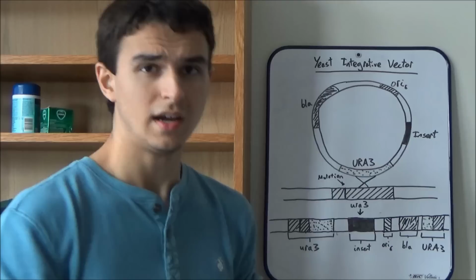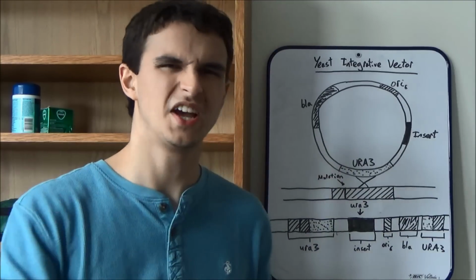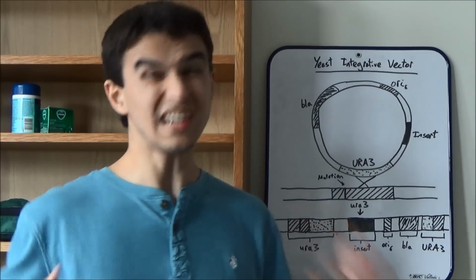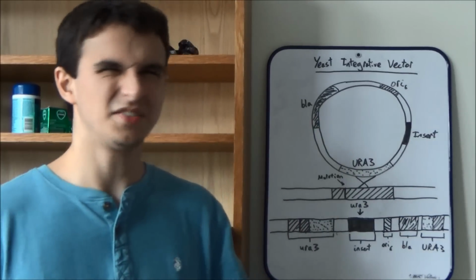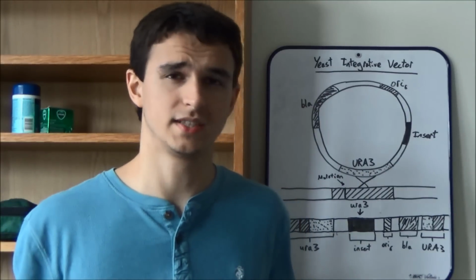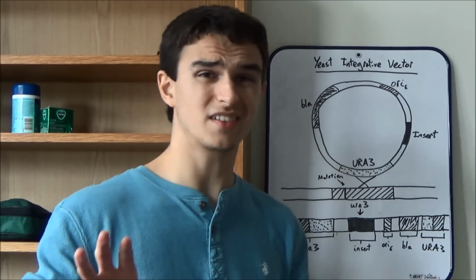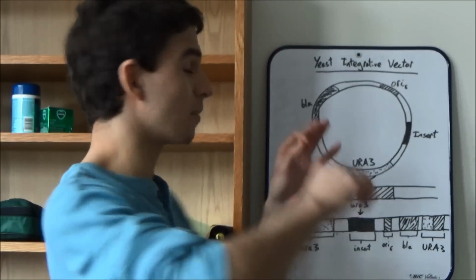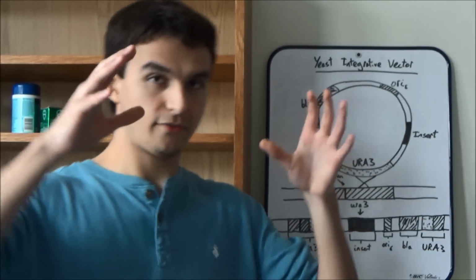Hello there, and welcome back to Molecular Methodologies. Now, in the past few videos, the only organisms we've really been talking about are prokaryotes. Well, in fact, the only organism we've been talking about is E. coli. So let's liven things up a bit in this video. We're going to be talking about something which isn't a prokaryote. Today, we're going to be talking about transforming eukaryotes, in particular, fungi.